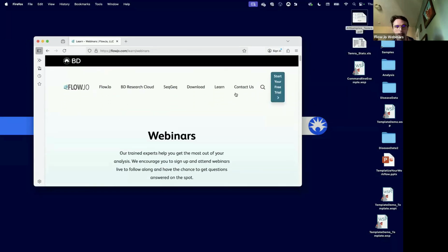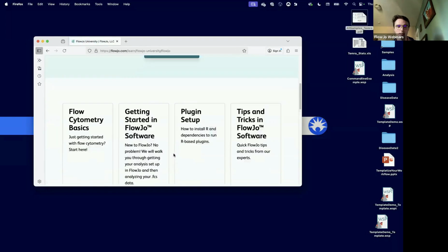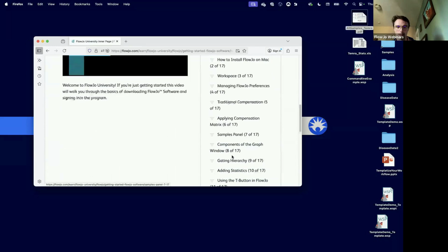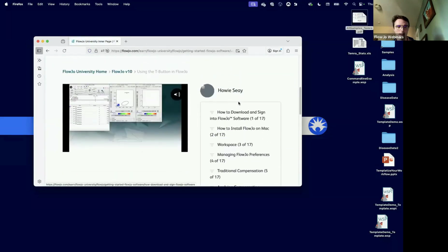I guess while I'm on the website, just to show, there is more information under the Learn tab here. If you go to FlowJo University, our documentation. So FlowJo University has all the videos, and in this case, we're using version 10, and you can see all of our version 10 videos. And so you can learn section by section each of the different options here, like the T button, which I think is important.